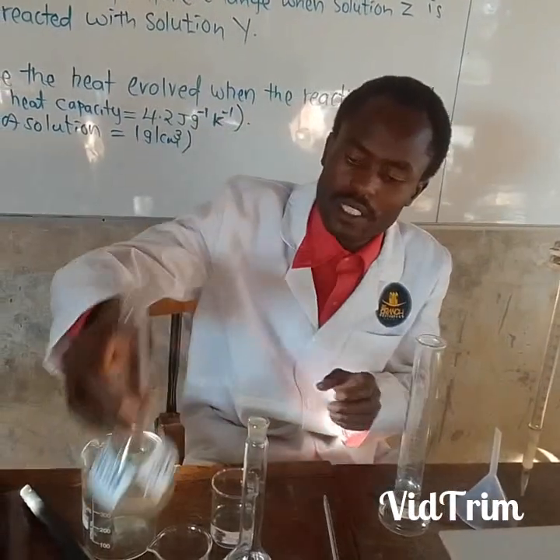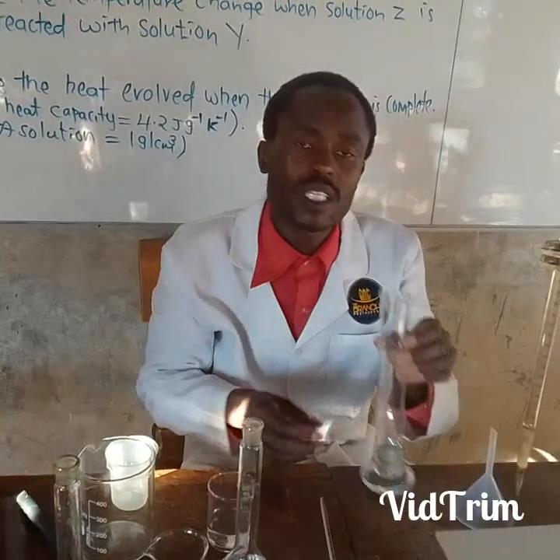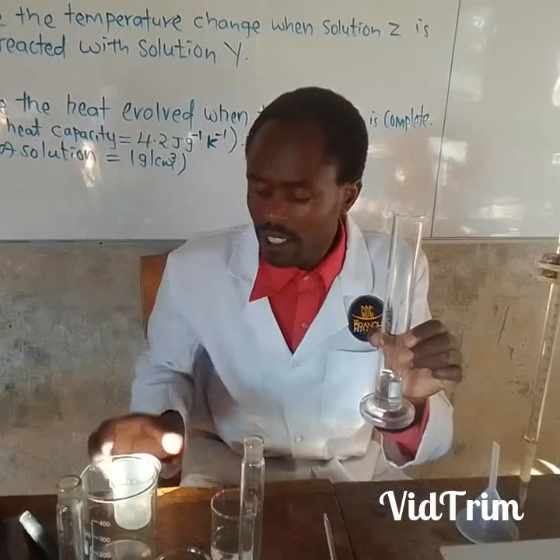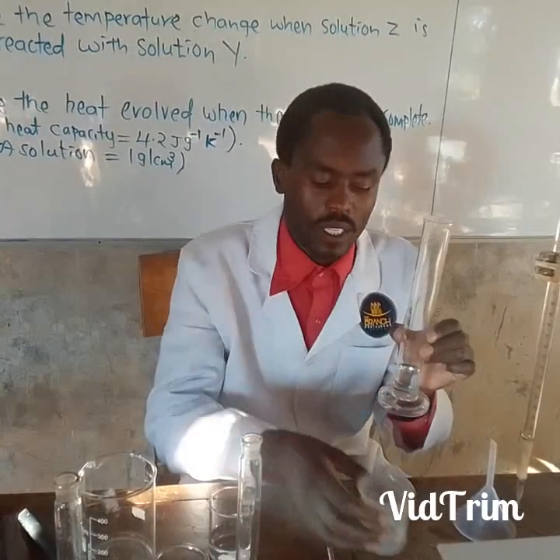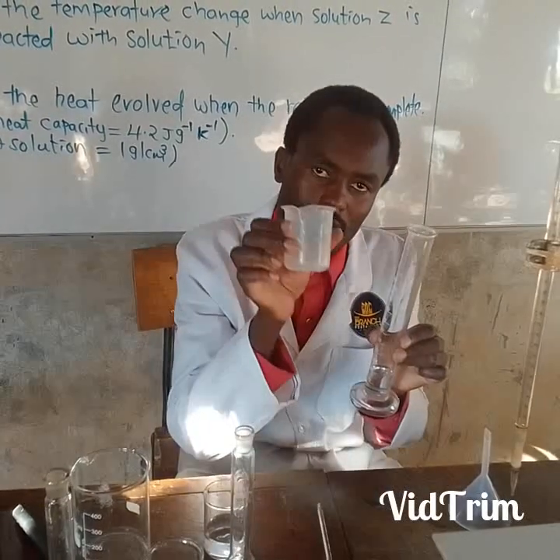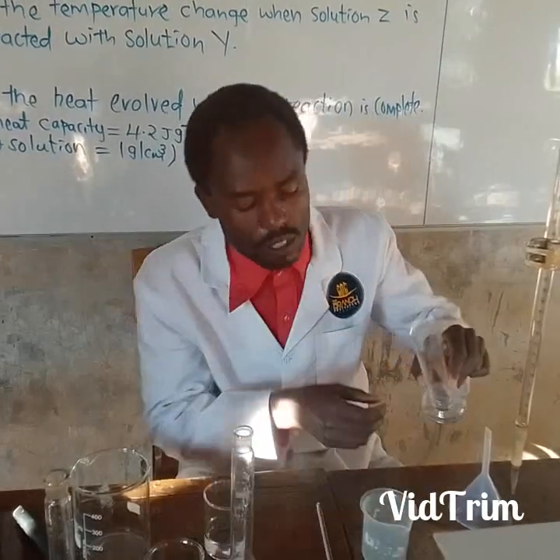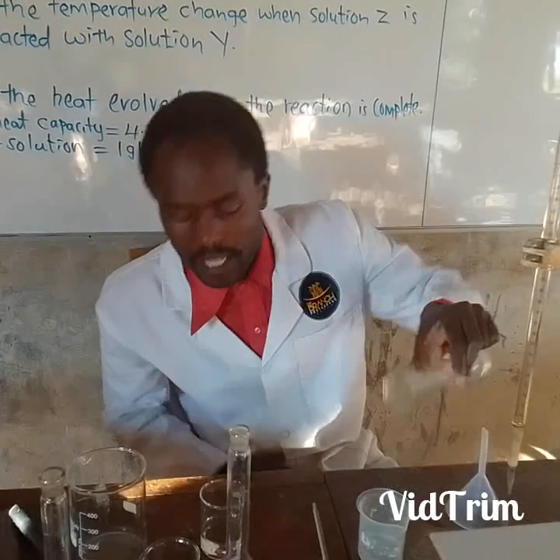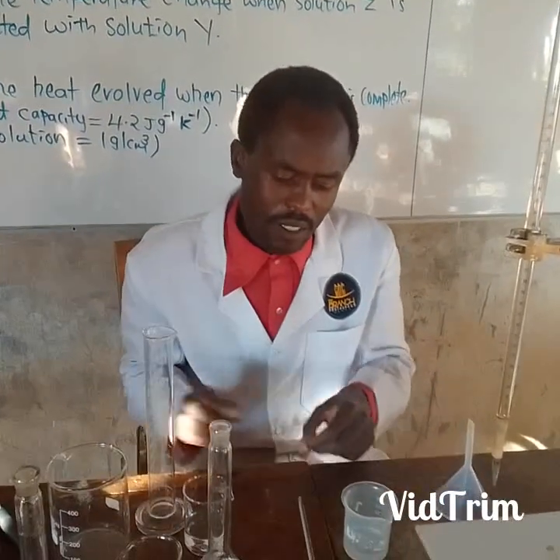So I have measured 20 mL of solution Z, the base sodium hydroxide. Then the next procedure, I transfer this solution Z into a clean plastic beaker like this. Let us go. Like that.